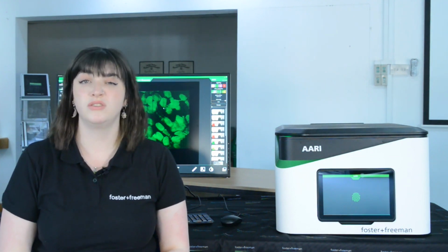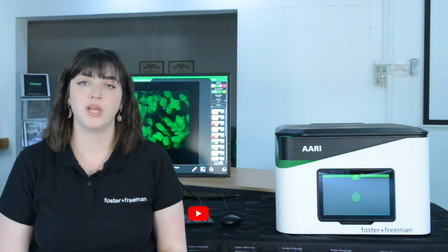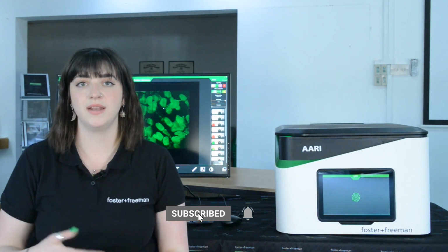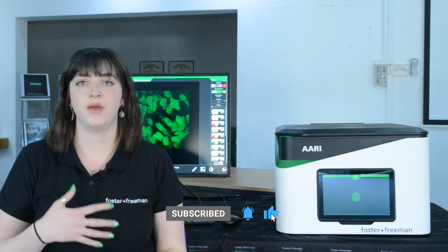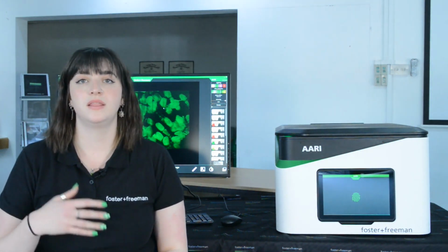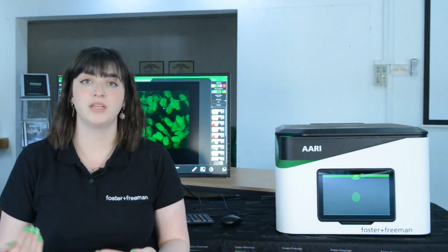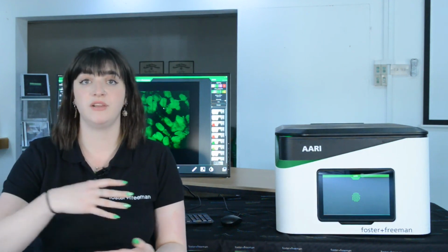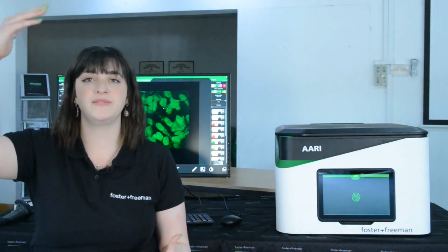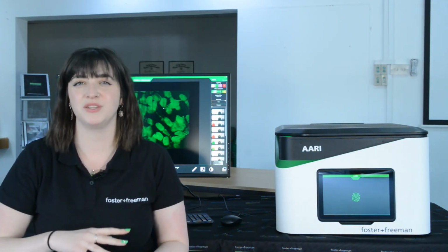process. So traditionally, what we would do is we would treat our porous evidence with common amino acid treatments. So that would be things like Ninhydrin or DFO or 1,2-indanedione. Then, after treatment with the appropriate humidity and heat as required for the treatment, the evidence would be examined using alternate light sources if appropriate, marked up, and then each print would be individually photographed on a system. And that would involve focusing the camera and then moving the evidence around beneath the camera to capture each mark.